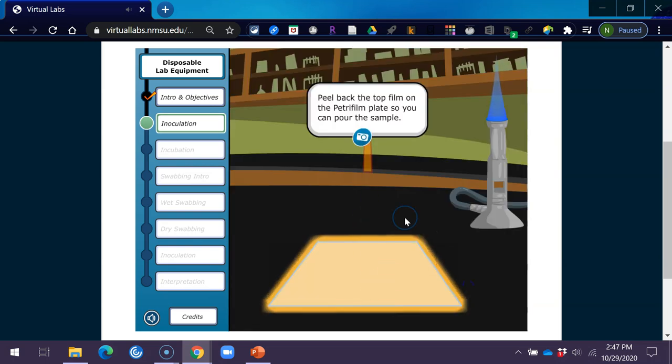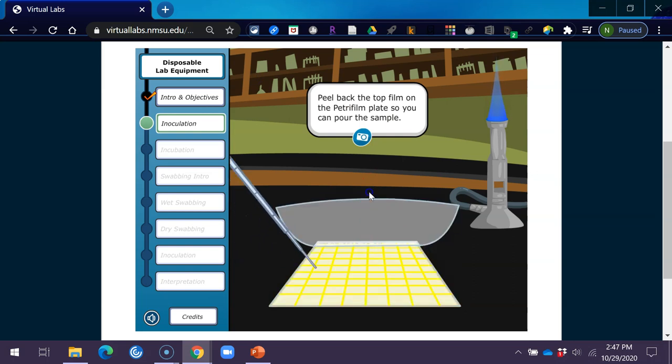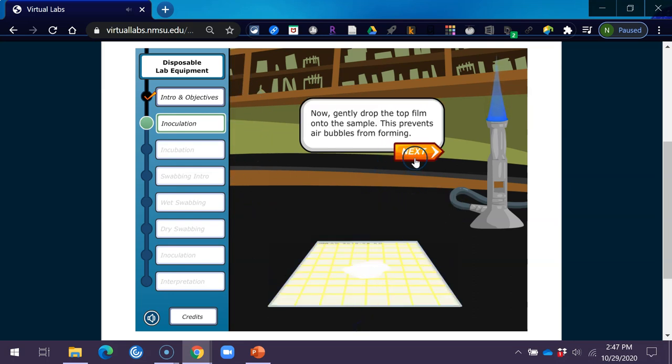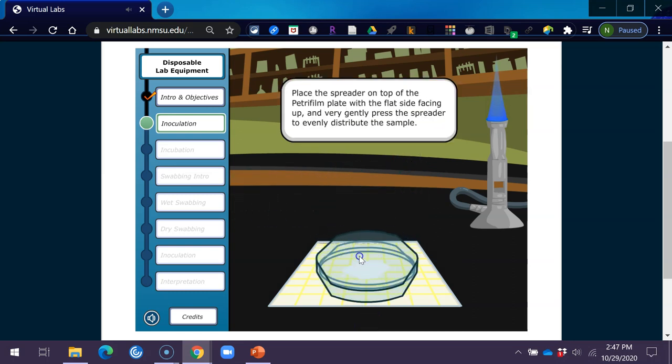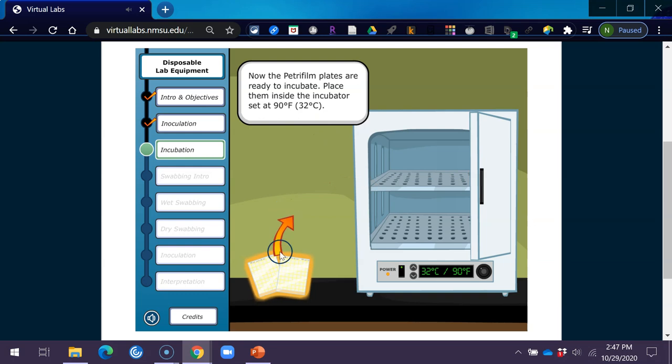Peel back the top film on the Petri film plate so you can pour the sample. Now gently drop the top film onto the sample — this prevents air bubbles from forming. Place the spreader on top of the Petri film plate with the flat side facing up, and very gently press the spreader to evenly distribute the sample. Your first sample is prepared. The Petri film plate for the pasteurized milk has also been prepared, and now both plates are ready to incubate.